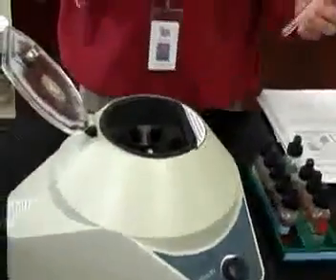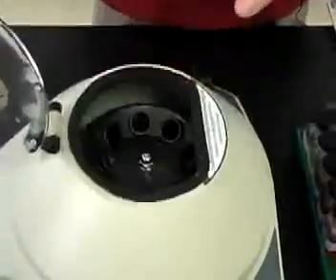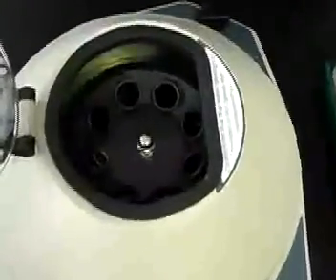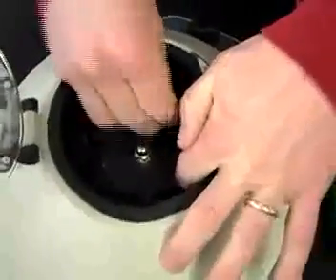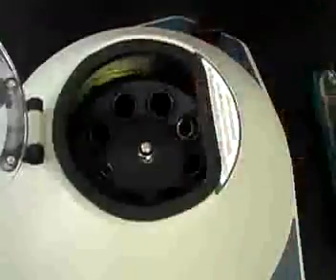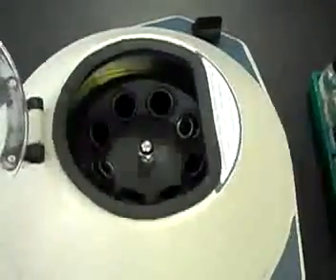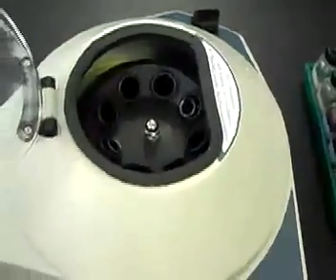And so when you load a centrifuge, make sure that you put the solution that you want to centrifuge on one side, and then add another solution, or a blank test tube with some water in it, exactly opposite of it. Exactly opposite. If you look at the bottom of the page we're looking at right now, it says page 124 on mine. You can see how to safely load a centrifuge.